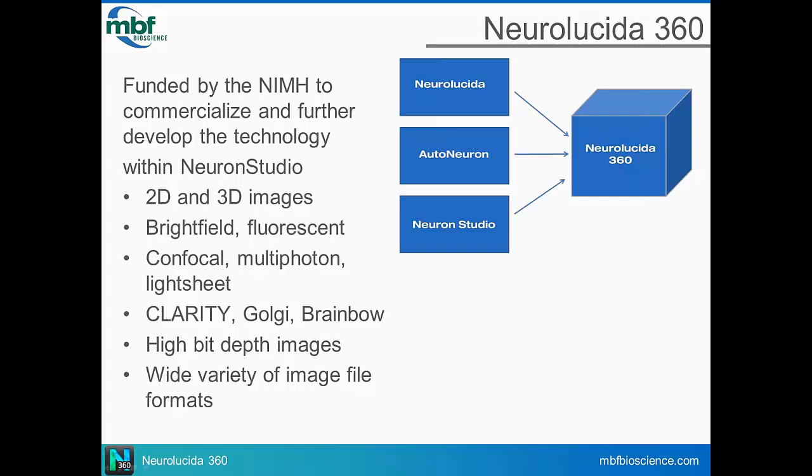So even though it's a fluorescent method, the fact that each cell is labeled with multiple fluorophores indicates that it becomes a question of hue rather than straight up color that defines what a neuron is. And so all of those things represent areas that are extraordinarily complex, but represent where science is going. And so, of course, Neurolucida 360 is going to take you there.